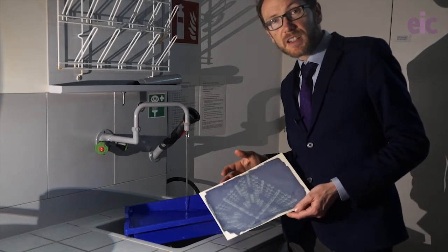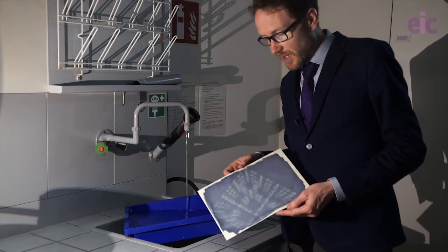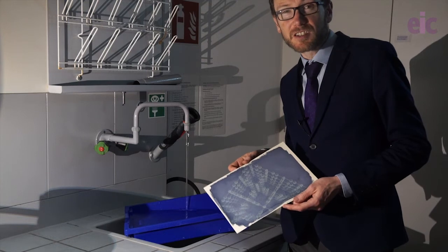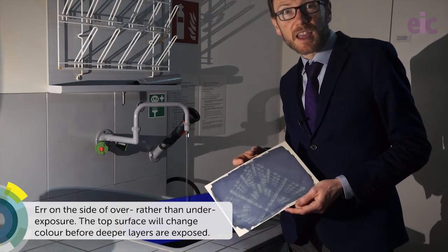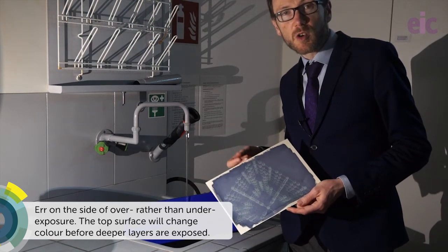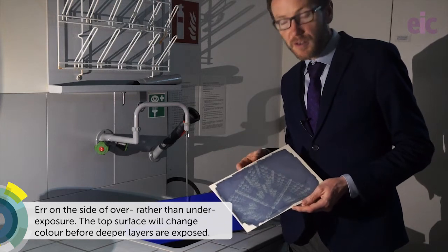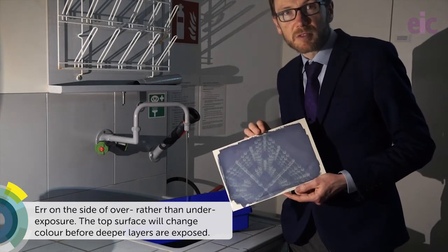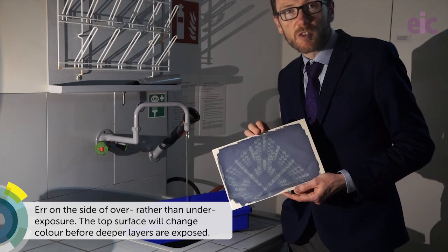So once your exposure is complete you want to rinse off any unreacted starting materials. I actually expected to leave this out for about 10 minutes but in the end it only needed about three minutes, because up until then I'd been working indoors. It's surprising actually how much UV drops off coming through glass, so do be aware of that. But you can eyeball it, and you can see I was able to get a reasonably accurate exposure of my structure of Prussian blue here.